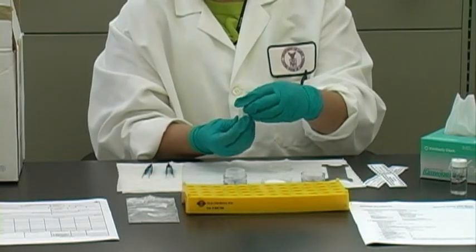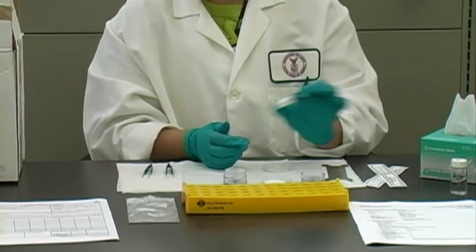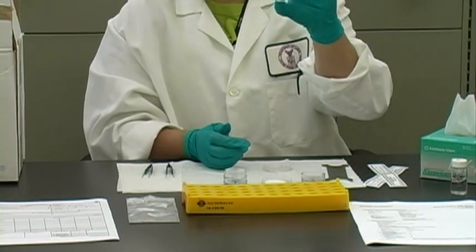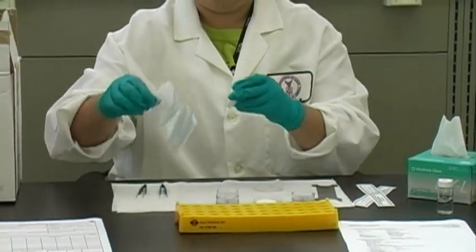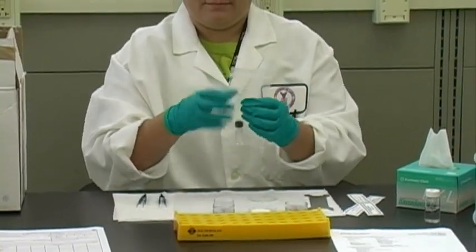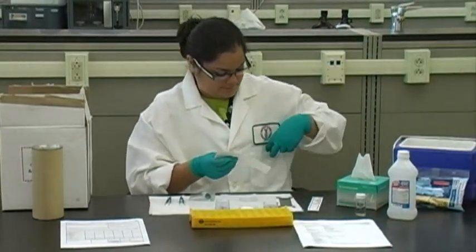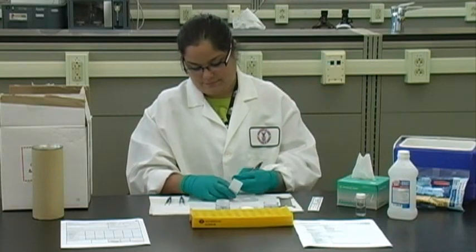Tightly seal the vial with the septum cap and vigorously shake the vial. Properly identify and label the sample. Wrap each vial end to end with a completed and properly filled out OSHA Form 21. At this point you can also discard the backup pad and cassette.